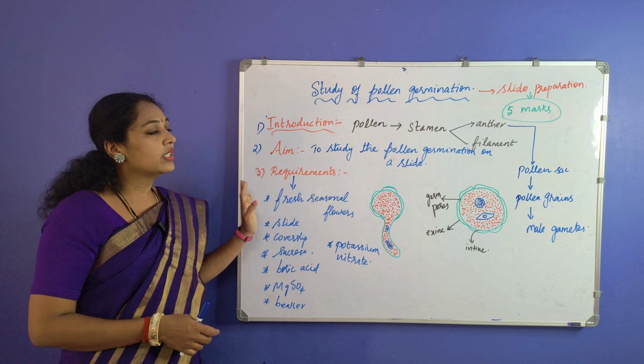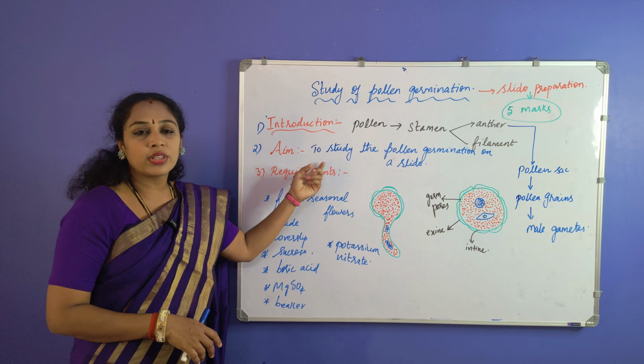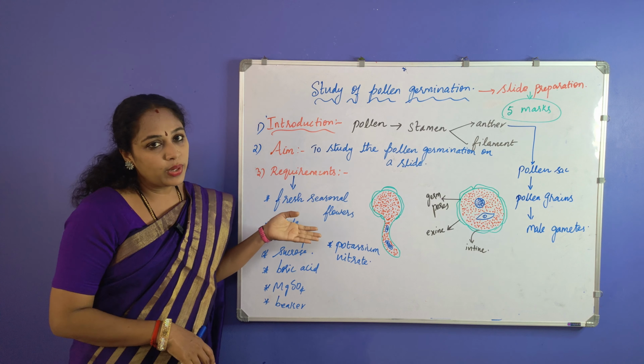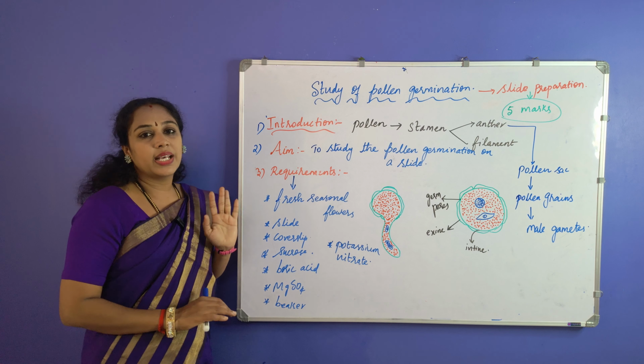In this video we're going to discuss all these key points and how to get full 5 marks for this experiment. Shall we get into the video, children? Now the first thing is the introduction.